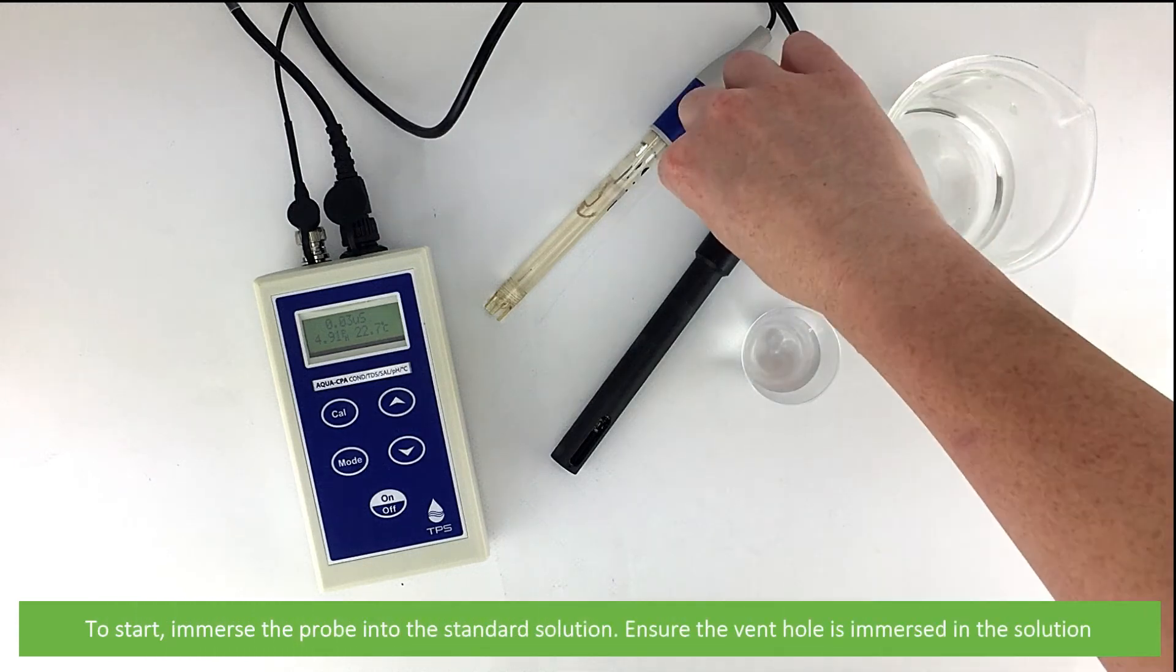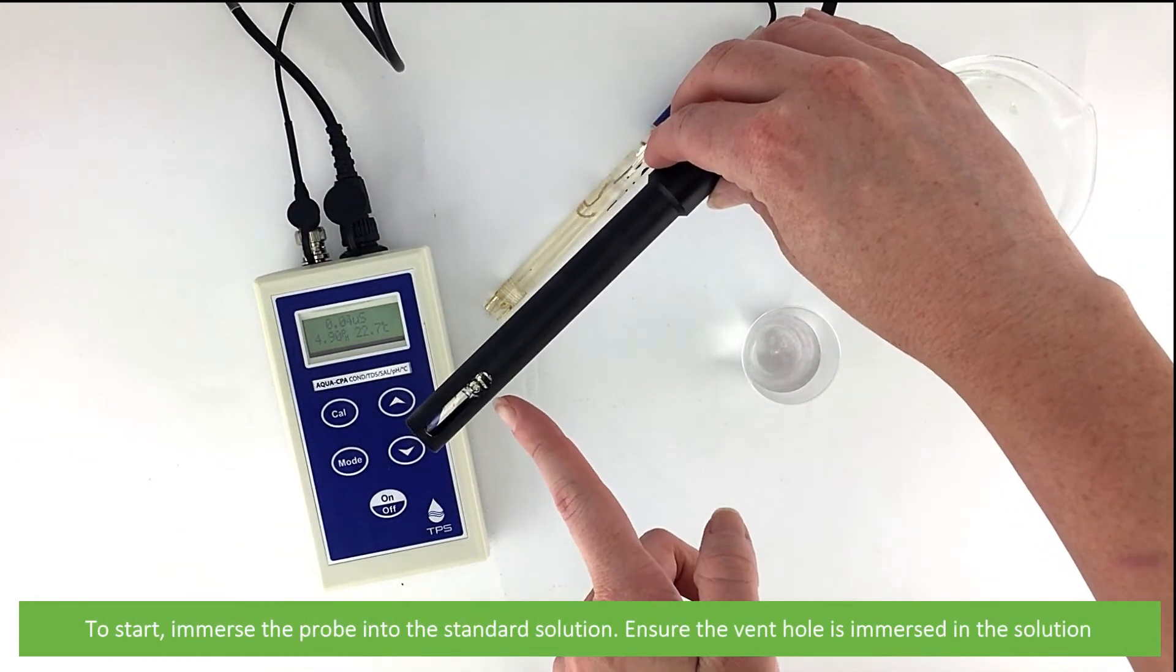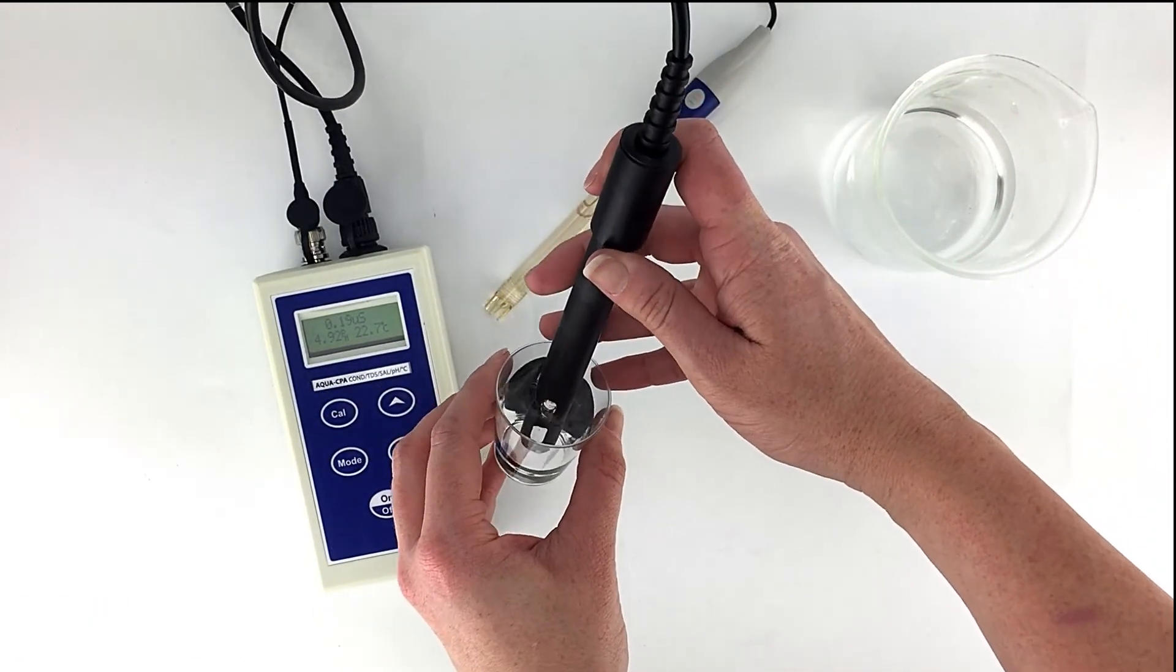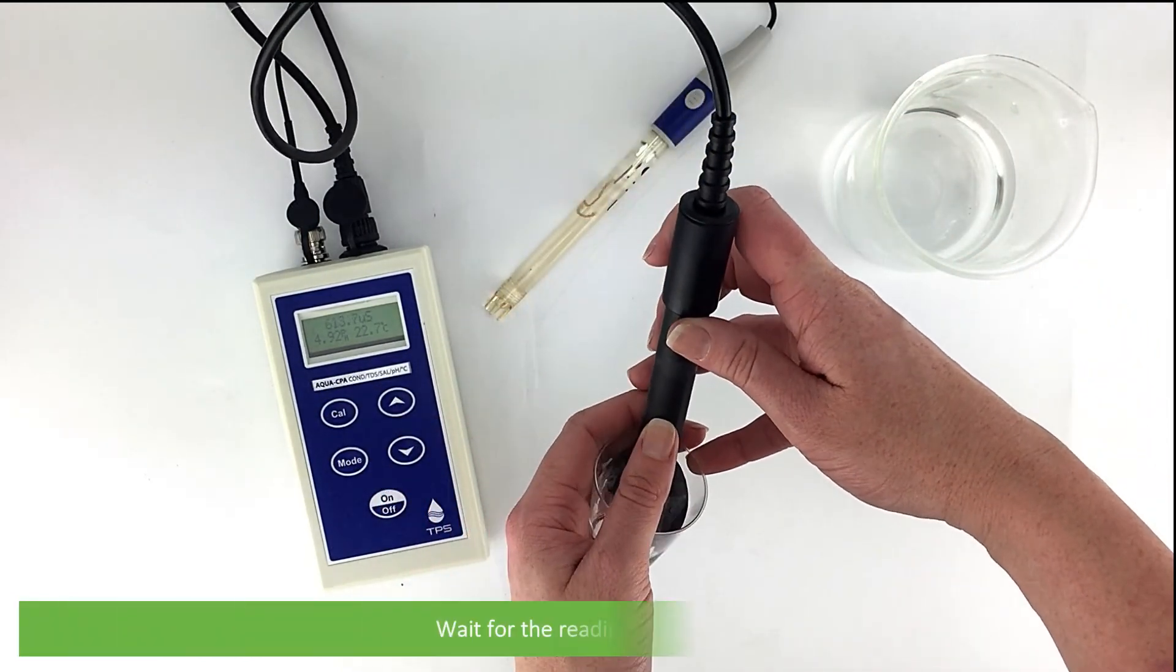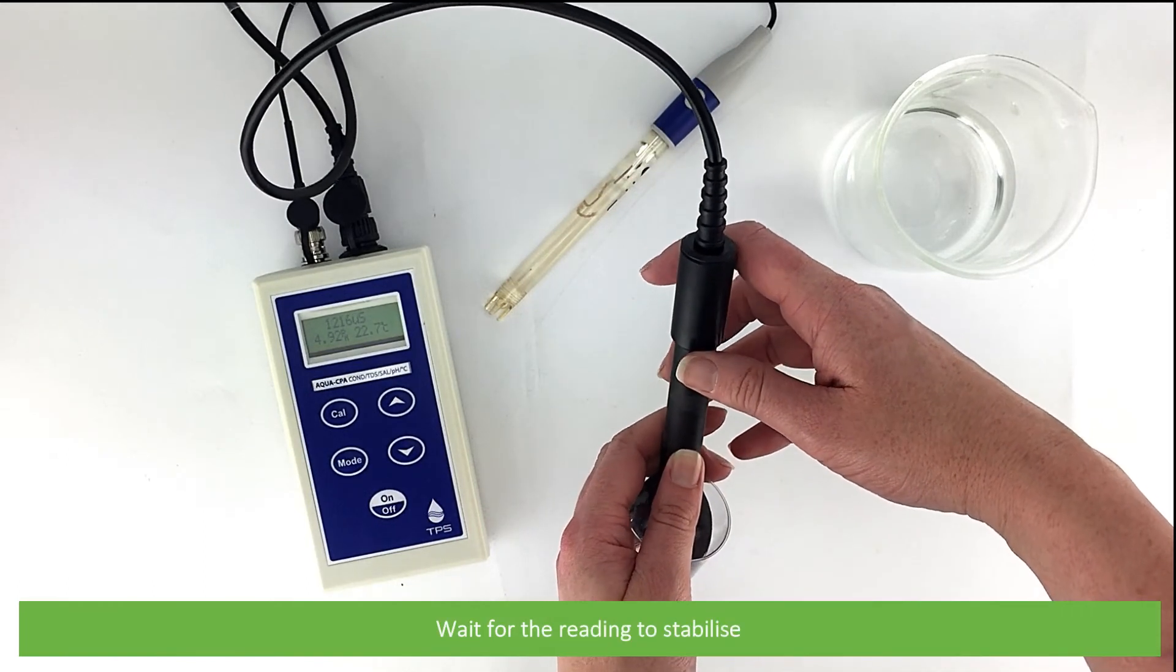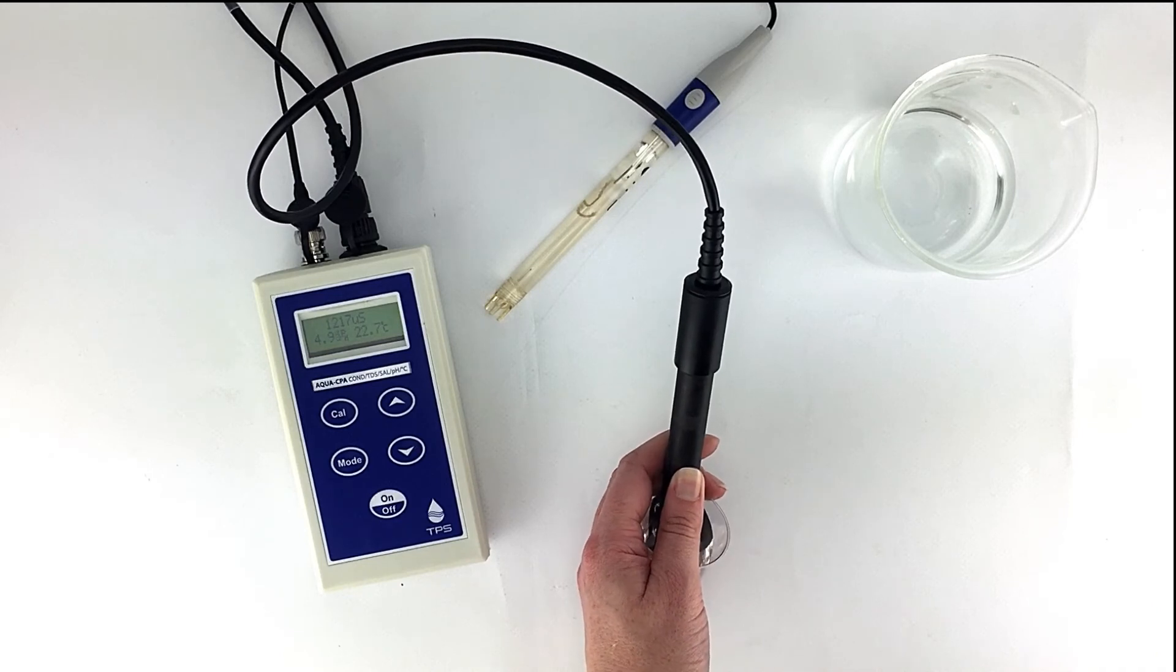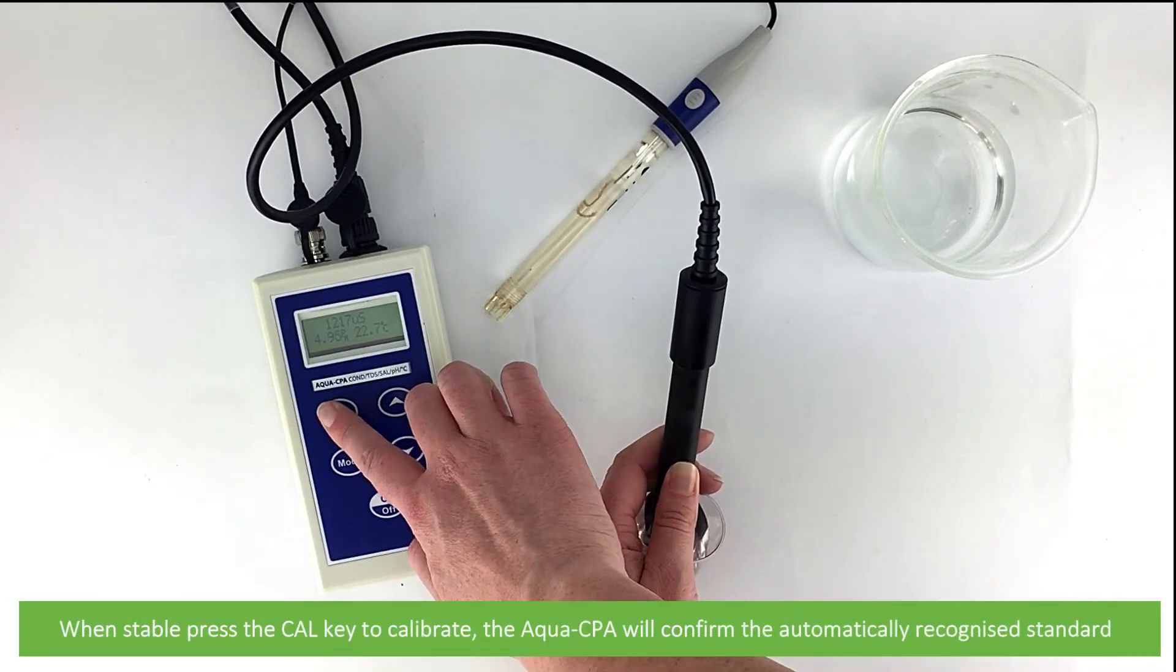Ensure that the vent hole is immersed in the solution. Wait for the reading to stabilize. Then, when stable, press the CAL key to calibrate.